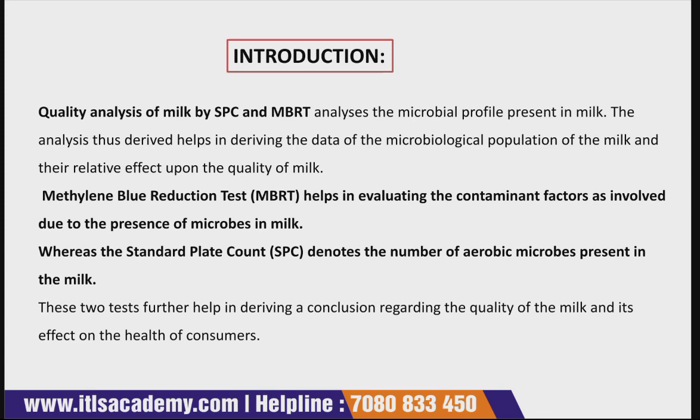The analysis thus derived helps in deriving the data of the bacteriological population of the milk and the relative effect on the quality of milk. MBRT, that is methylene blue reduction test, helps in evaluating the contaminant factor involved due to the presence of microbes in milk, whereas SPC, that is standard plate count, denotes the number of aerobic microbes present in the milk. So these two tests help in deriving conclusions regarding the quality of milk and its effect on the health of the consumer.